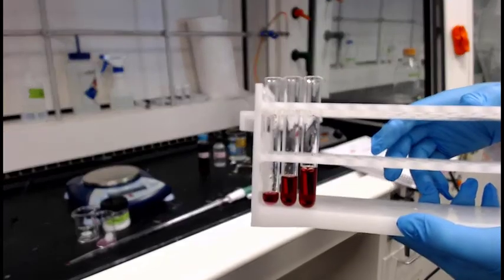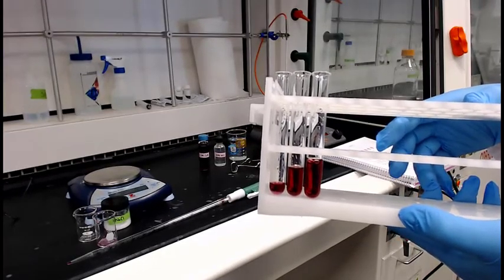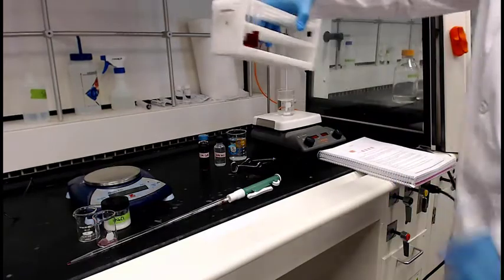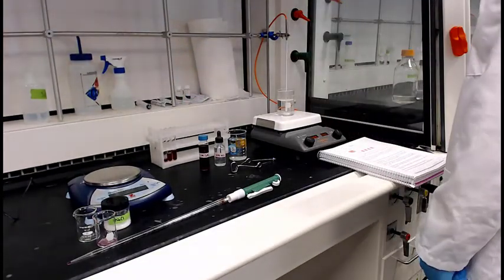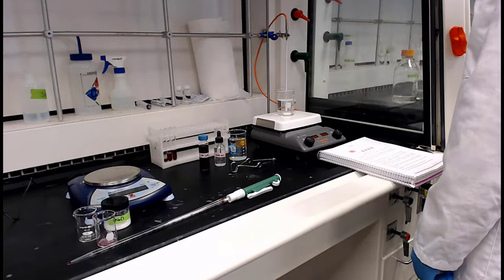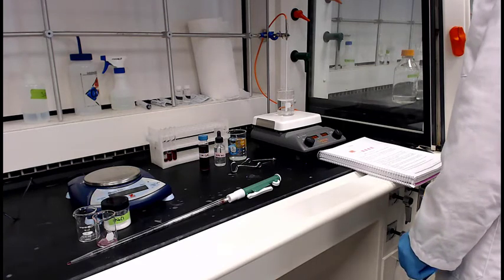So here you go. There's the 1/2, the 2. The middle one's the color reference. So if you want to take a shot of that, that's your color reference. The right one is test tube 3, and we're going to do different reactions with all 3 of those. We're going to see if we can push equilibrium.